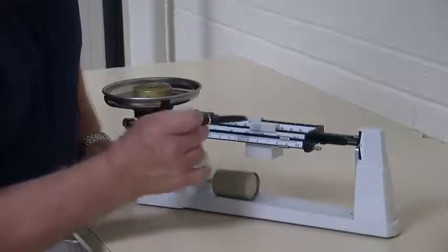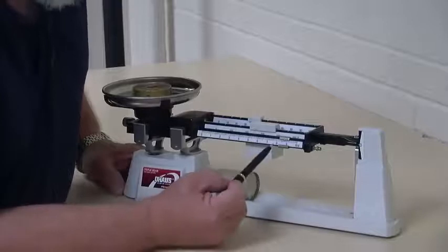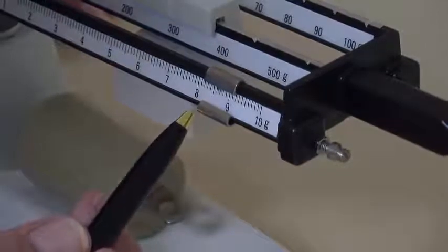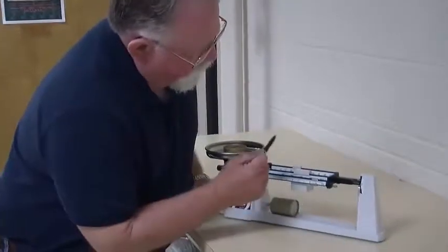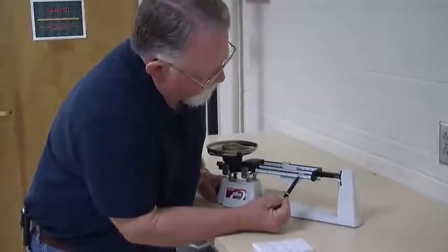Let's call that good. We'd read that 300 plus 40 plus 8.7, and it's about 7 tenths of the way to the next mark. So 348.77.